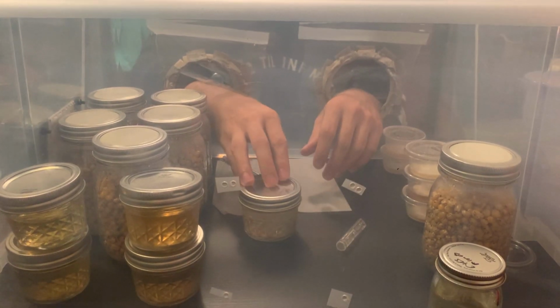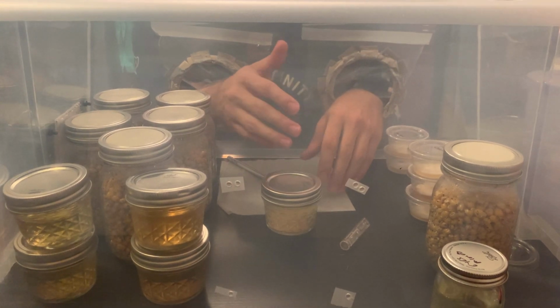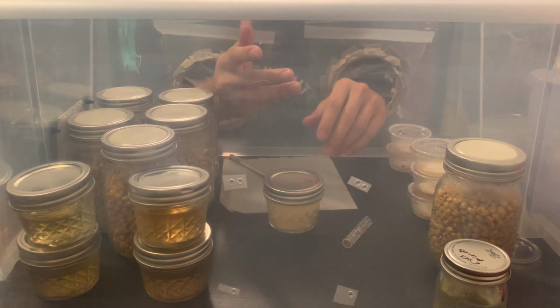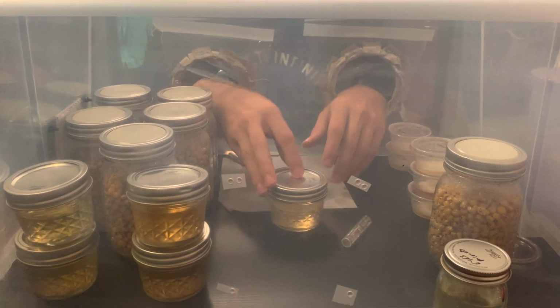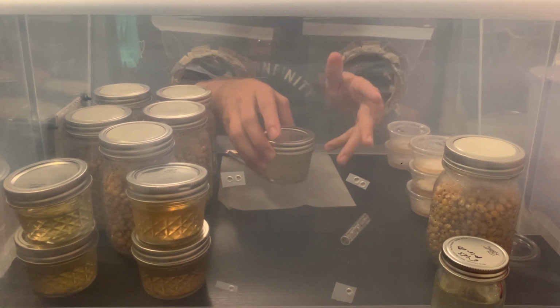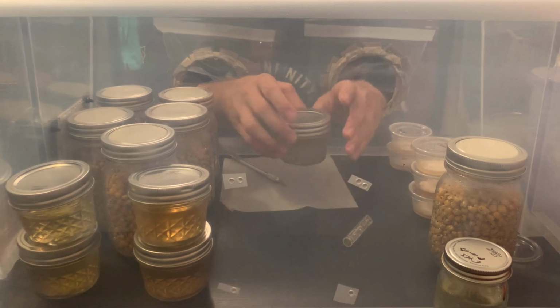Alright, so now we're ready to inoculate our jars. For this, you're going to either want to invest in a flow hood or a still air box. Something like this is going to work fine. This is just a plastic bin with some armholes cut in it. Works just fine. So when you get in here, you're going to want to wipe everything down, sterilize everything. Some people wear gloves, but that's not my thing. I just use hand sanitizer and it's good to go.